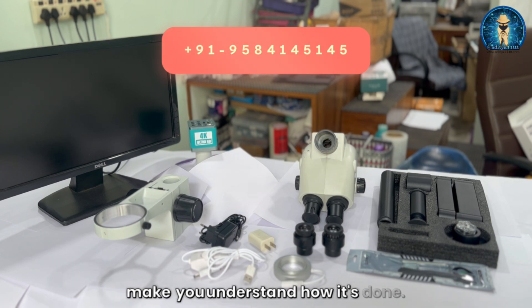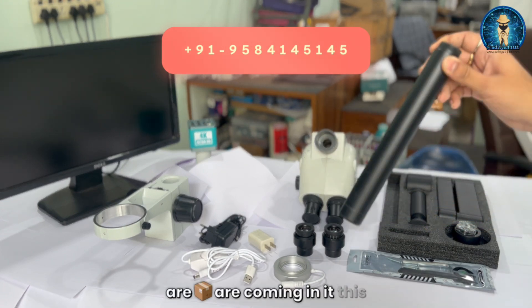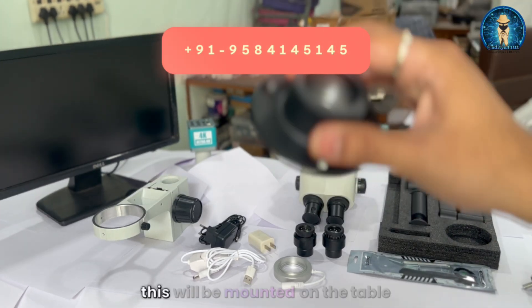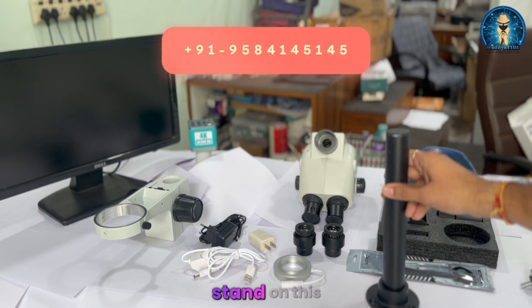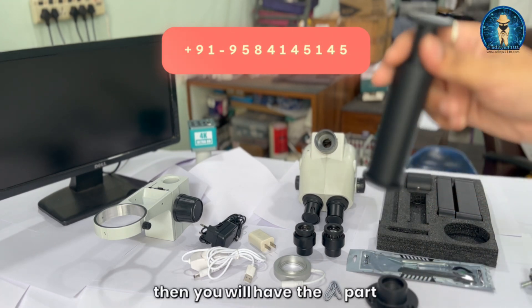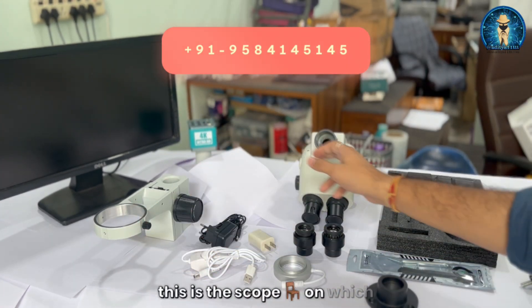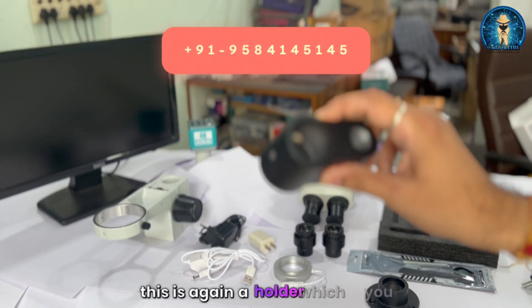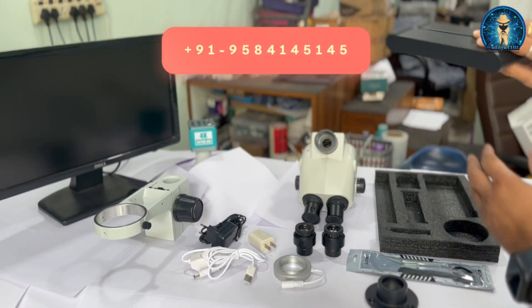Before going into the assembly, I would like to disassemble the set and show you what components come in it. This is the base which will be mounted on the table. Then you mount the stand on this base. You also have the holder part — this is the scope stand on which the microscope will rest. This is again a holder, and there is a knob for locking.